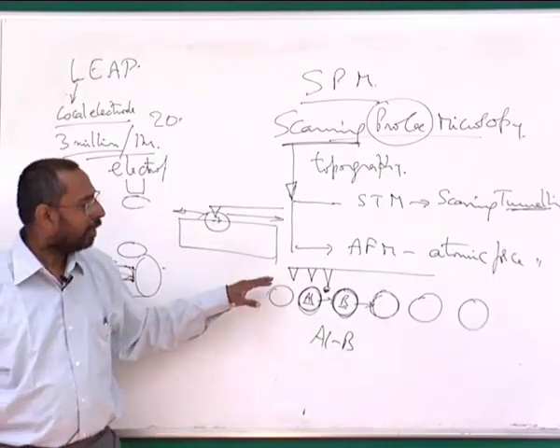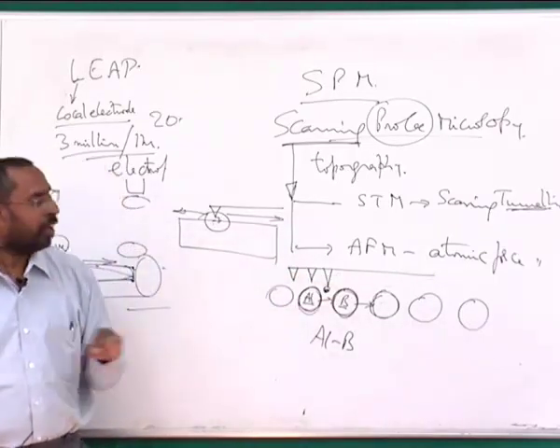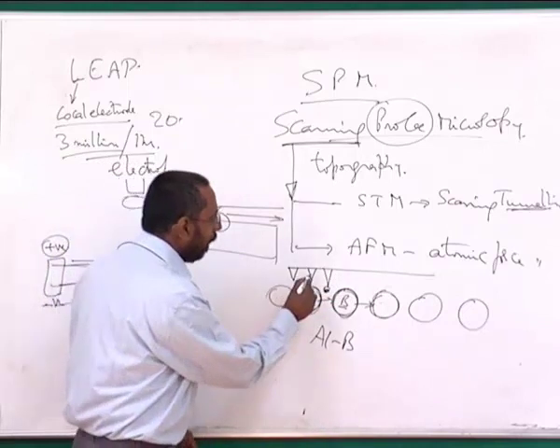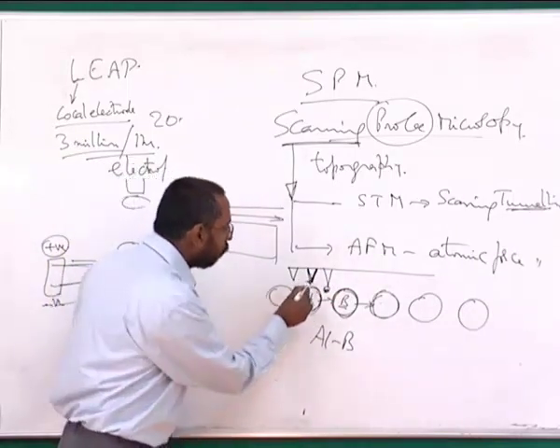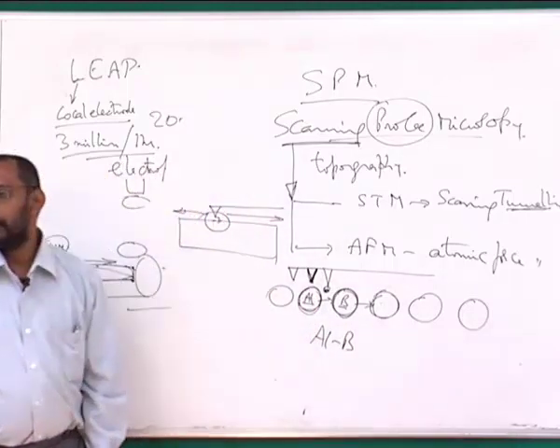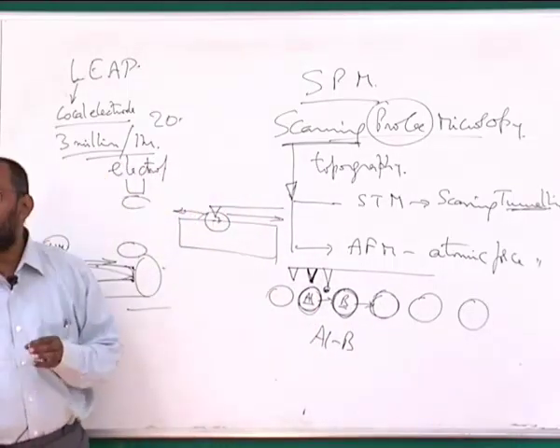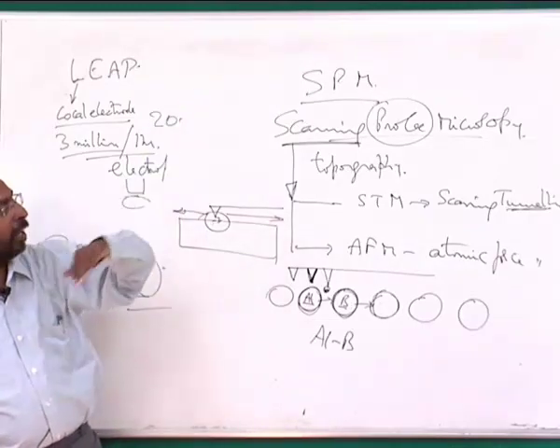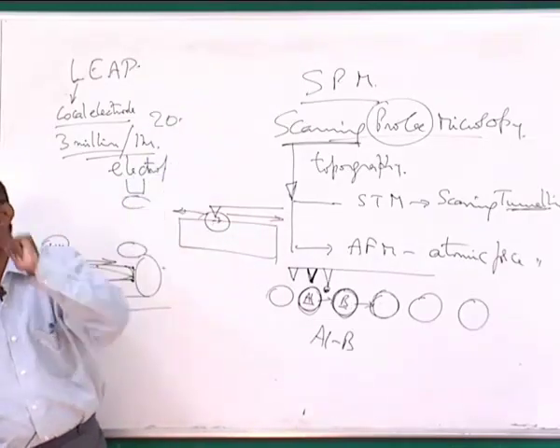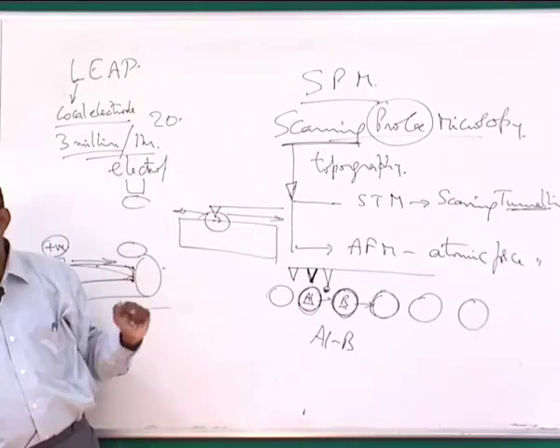So the surface has to be extremely polished and the tip has to have an extremely fine radius. In principle, the tip has to be a one-atom kind of tip. So that is the level of preparation of the tip that is important. What we talked about earlier, to prepare a sample for a field ion microscope, similar preparations have to happen.